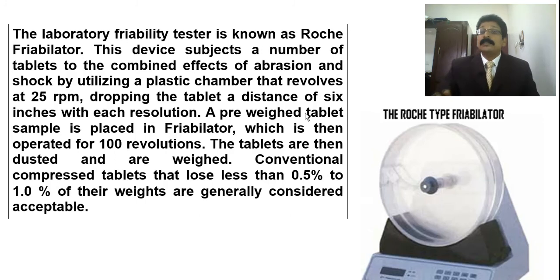So this is a second control over the tablet finished product evaluation. Even in process checking it is needed. In that place itself we can correct the tablet production and we can make the correction in the initial stage itself. So in process checking, the friability tester is also very much important, like how you are testing the hardness of a tablet.